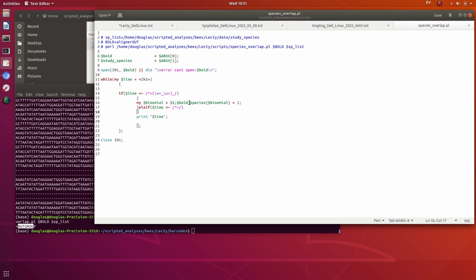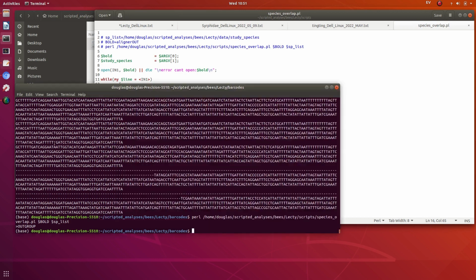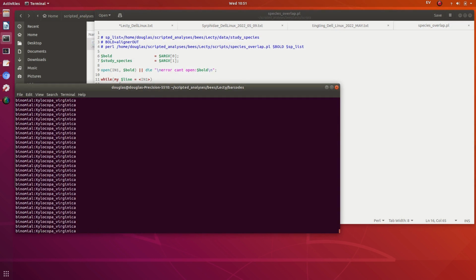Right, let's just print this, check we're capturing what we think we are. Okay.